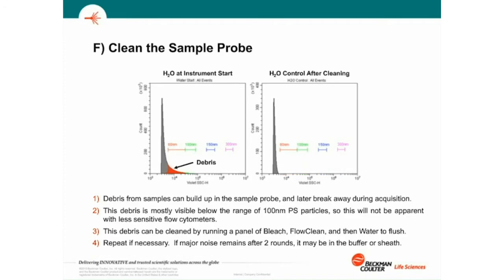Finally, it's important, if not critical, to make sure that your sample probe is cleaned. Debris from samples and buffers will build up in the probe, and this can later break away during acquisition. Due to the nature of small particle detection and characterization, any debris is sheer noise in your system, so it's important to clean this up.